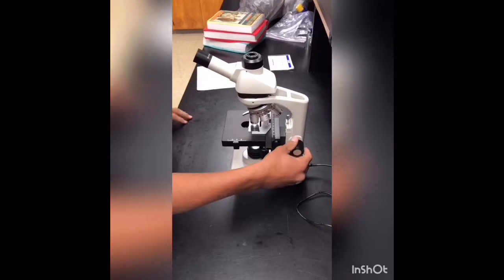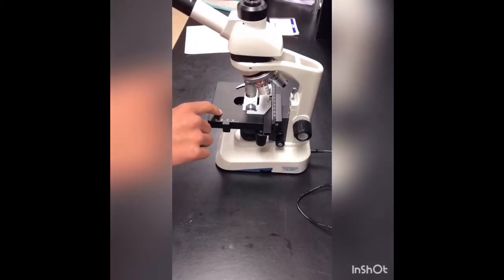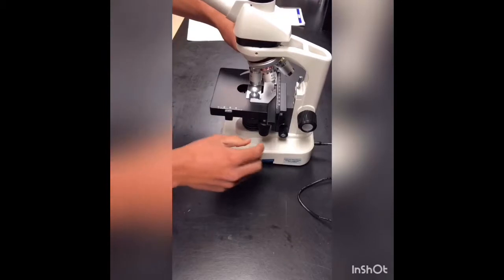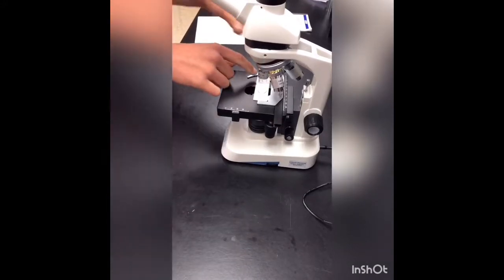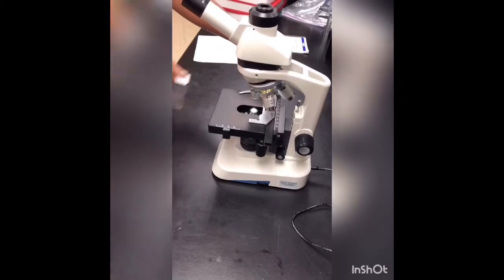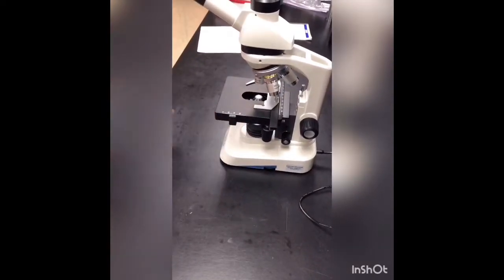Okay guys, so this is how you put the microscope away. You want to make sure with the coarse adjustment knob that the stage is all the way down, and then you want to make sure that the microscope is on the lowest magnification mode, and then you want to take your slide off of the microscope, and then you need to make sure that the diaphragm is turned down so the light is as low as possible.